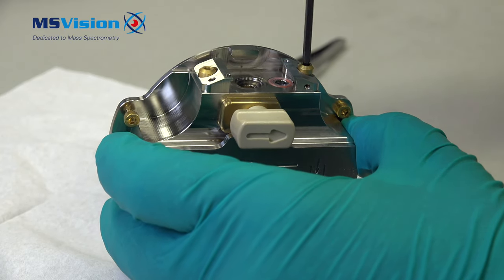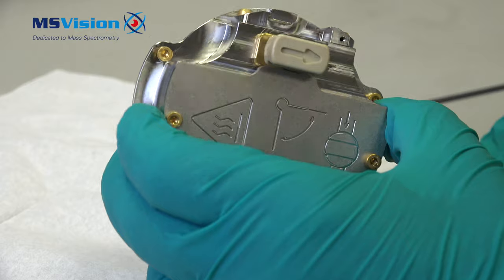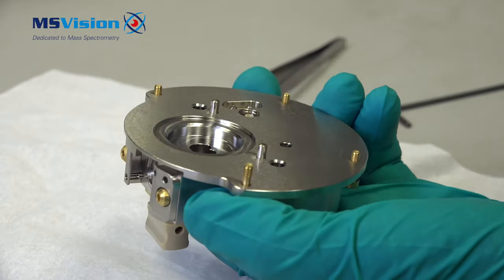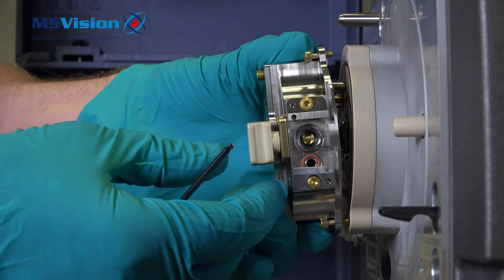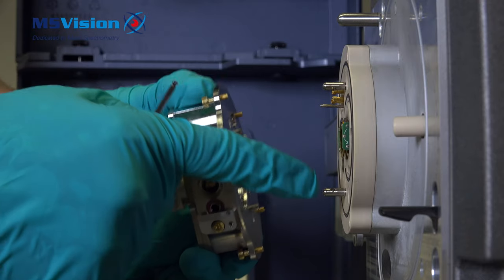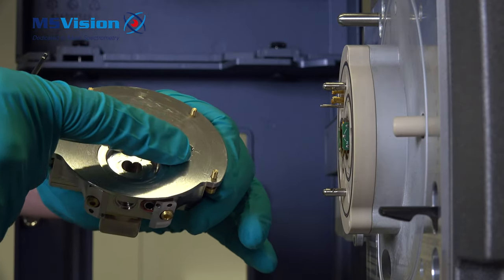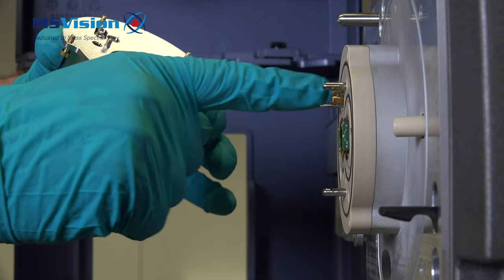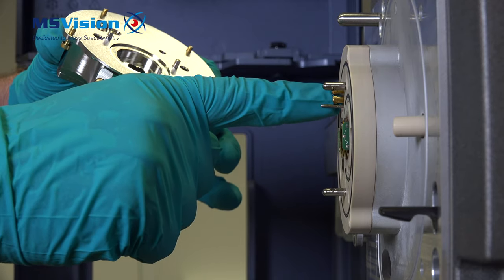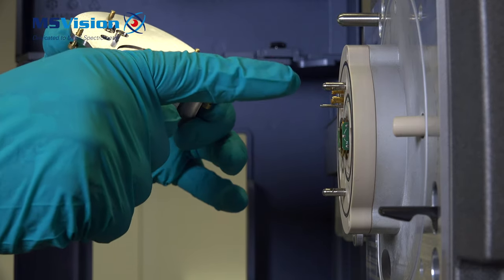Now it's fully reassembled we can put it back on the instrument. Align all the holes. These pins are for alignment. Here these are electrical feed-throughs for the heater and for the temperature sensor and cone voltage, there's a temperature sensor.